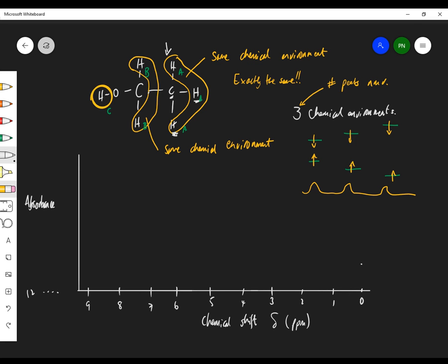So this is the chemical shift. And the chemical shift, let's draw a line in here. This way means increasing frequency. Oops. That's not right. Let's get rid of that. I'm trying to squash it in. So this is increasing frequency down here.